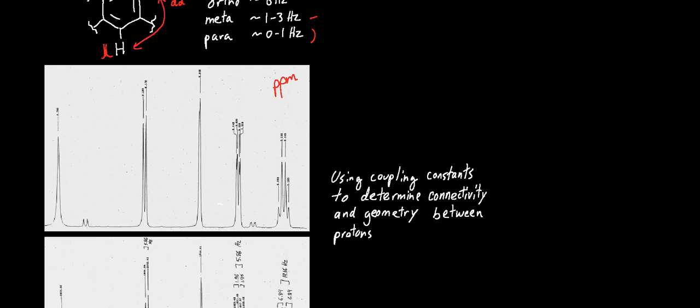So the ppm values are not used for coupling. Notice the spectrometer gives you values for the tops, so you would have to take the middles of these for the ppm value, say, for that signal. Below is the same spectrum where I've calculated coupling constants in Hertz. So this was reprinted in Hertz values.